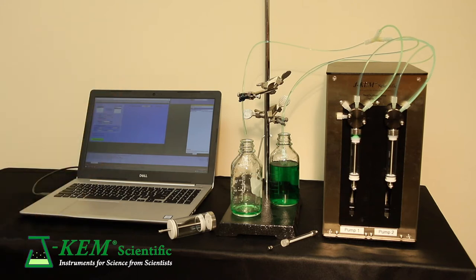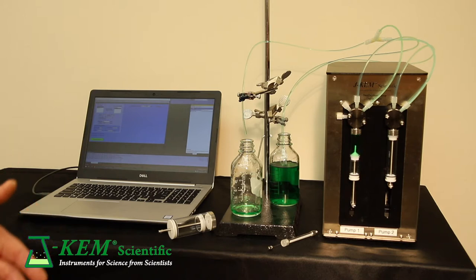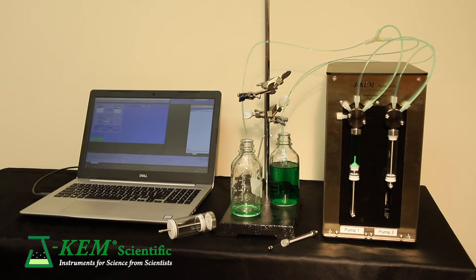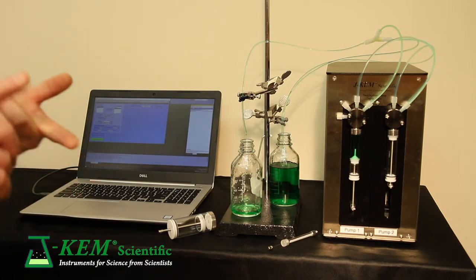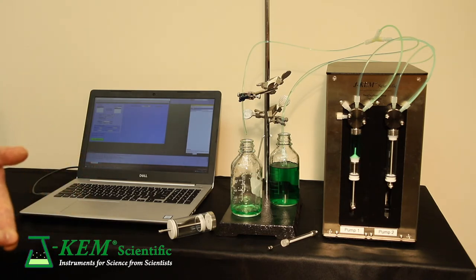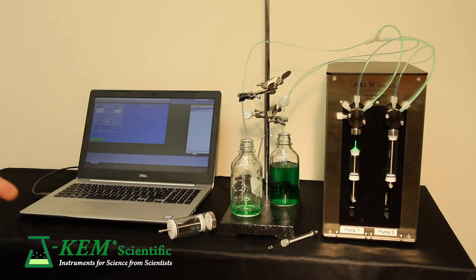Now that it has just delivered its first 10, it's going back to get 10 more. And then once it's full, it will resume its addition at the exact same rate. The first feature is all the pump systems automatically refill. So you can deliver any volume from any system.